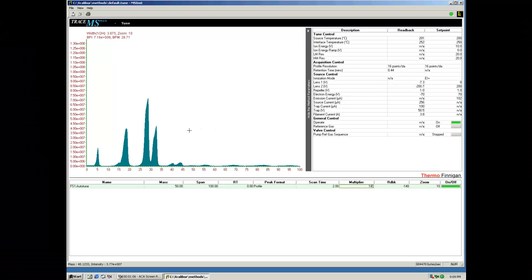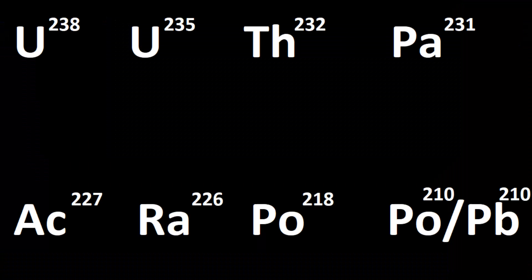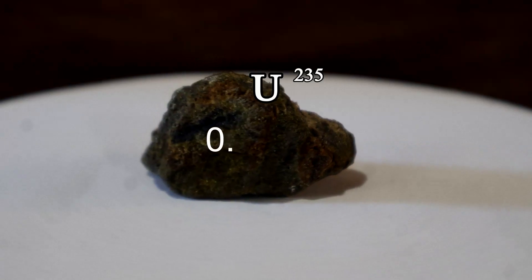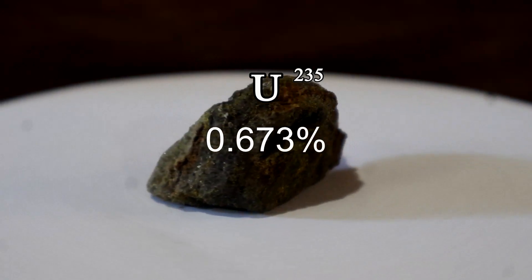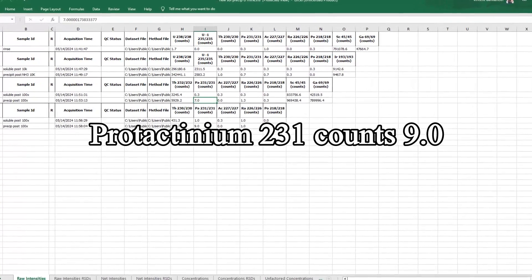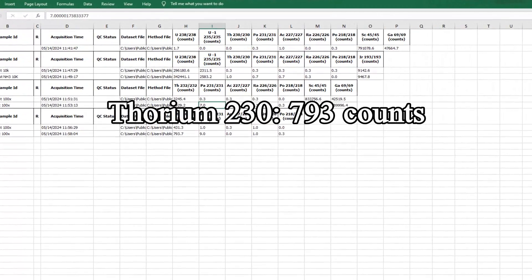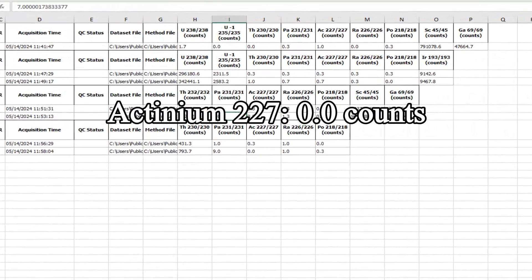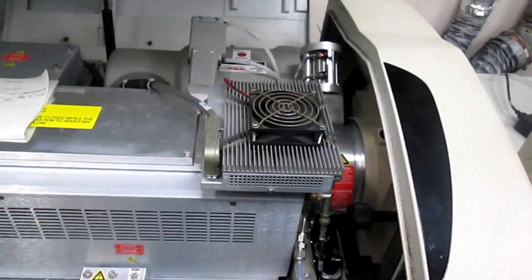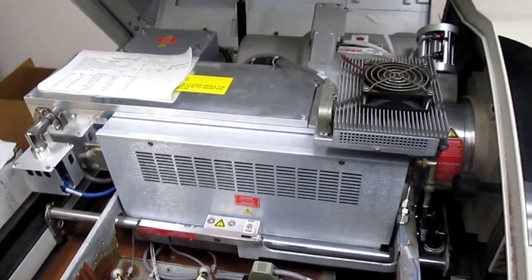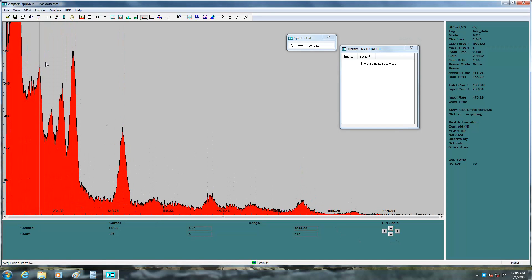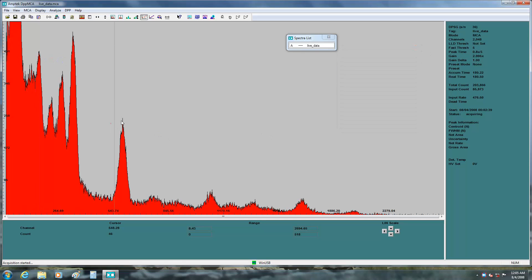To avoid these isobaric interferences, I narrowed down my list to eight isotopes. I can also verify the natural abundance of uranium-235 at 0.673%. Protactinium-231 did make a discrete appearance with low RSDs. Good confidence factors on the thorium-230 and radium-226 — no surprise there. Actinium and polonium are still a no-show, also not a surprise. The mass spectrometer struggled to lock on a good signal from a few trillion atoms or less, where the gamma spectrometer can easily make a reliable detection. In that way it's not really a fair comparison, since the energies involved are several orders of magnitude apart.